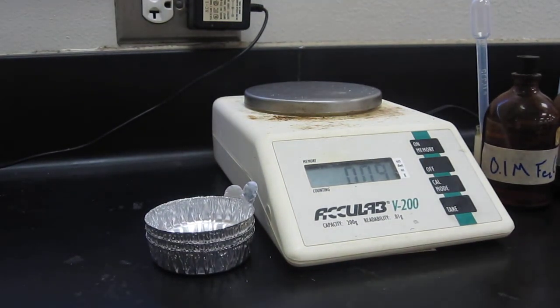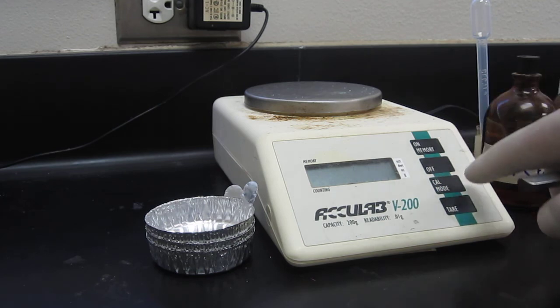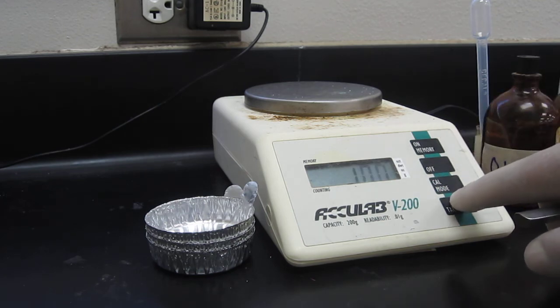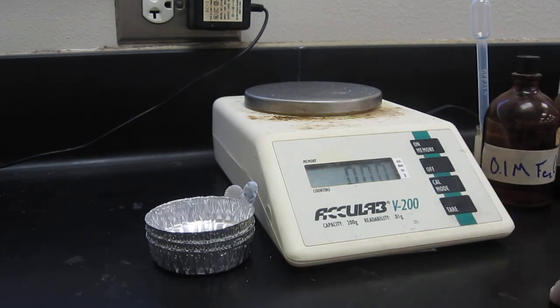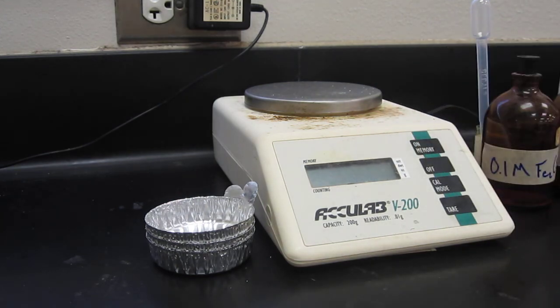So now just take the weigh boat off. Notice it's discounting how much the weigh boat weighed. We can push tare again and get it back to 0, and then push the off button and turn it off.